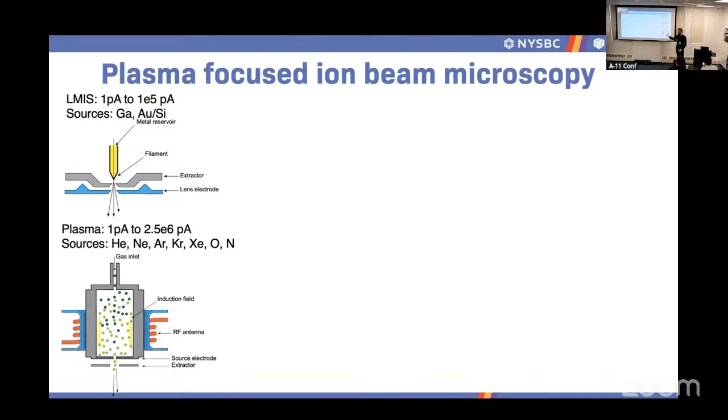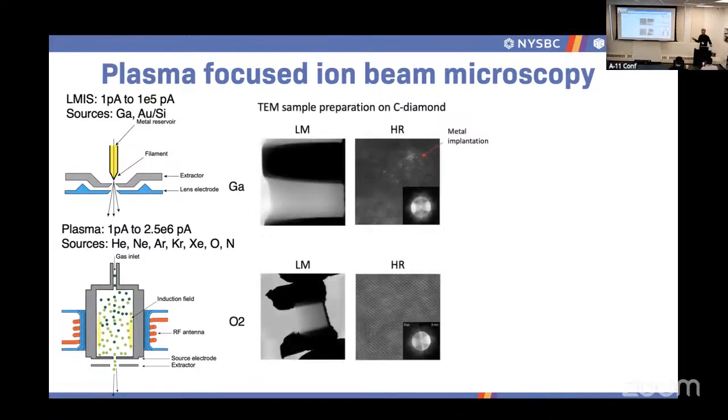So you will crank up the current up to the point that as many ions can cross that orifice. And if you lower the extraction, you will still have a spot size of the same size.